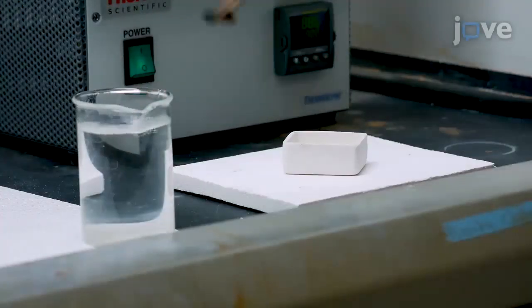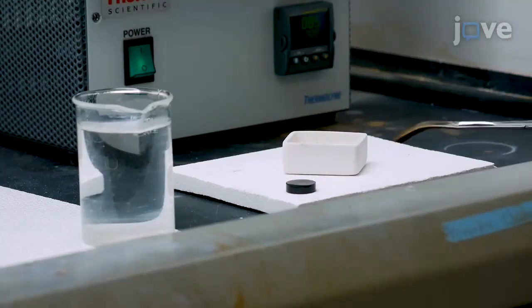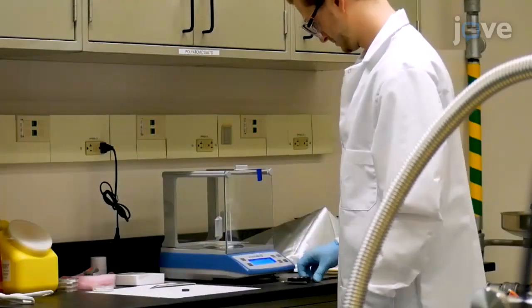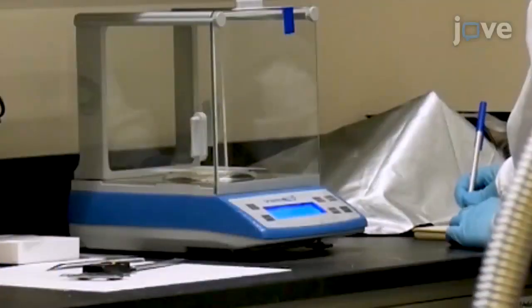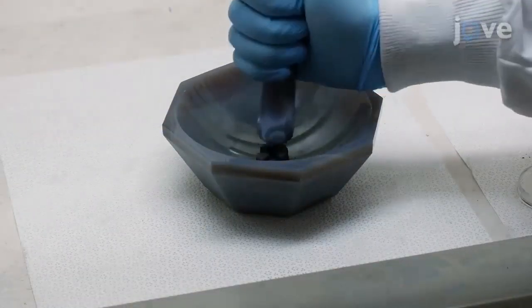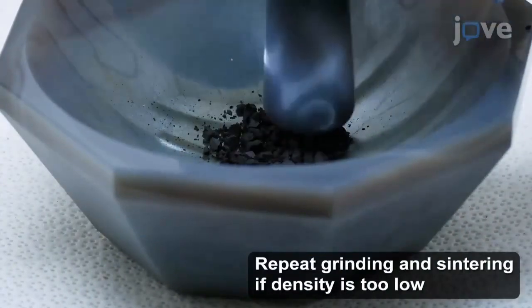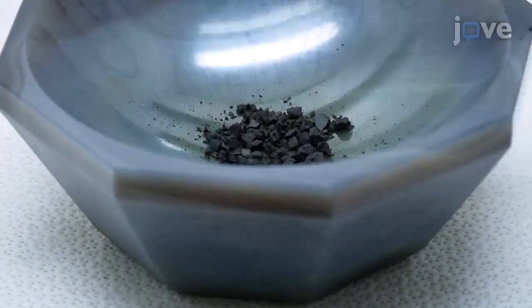When the target is no longer sputtering, remove the target from the water and set it aside to air dry. Once the target is cool and dry, calculate the target density and the percent theoretical density. If the measured density is insufficient for pulsed laser deposition, regrind and resinter the target. Prepare additional targets in this way as desired.